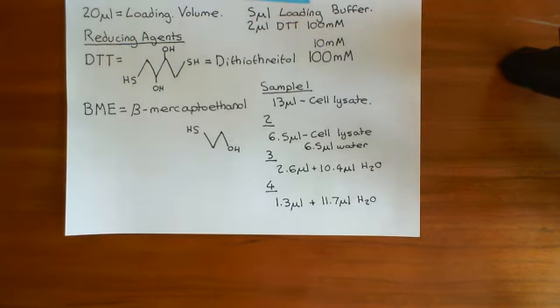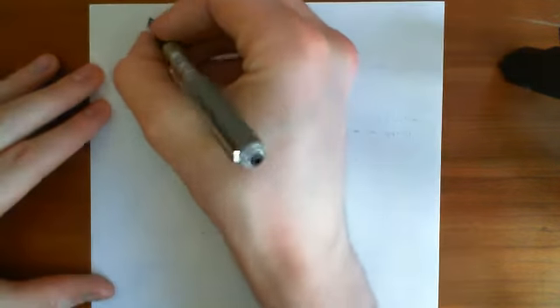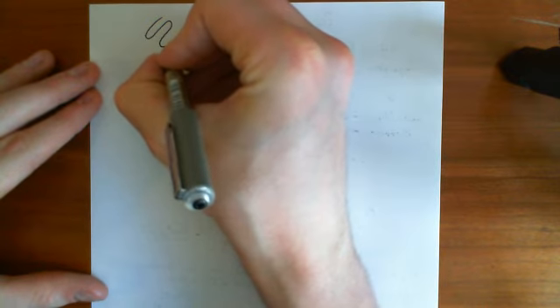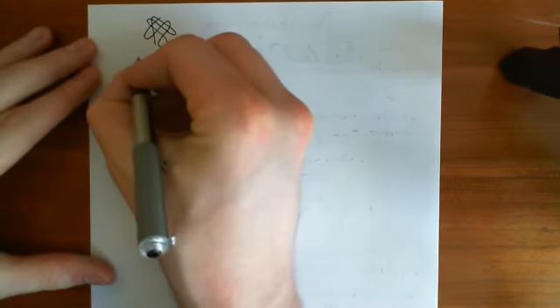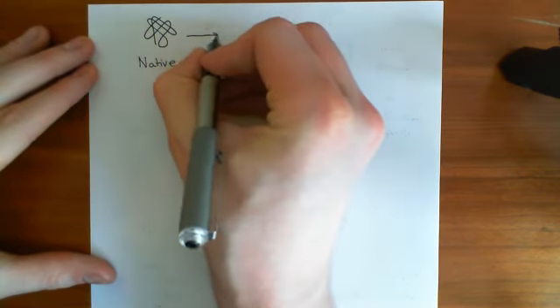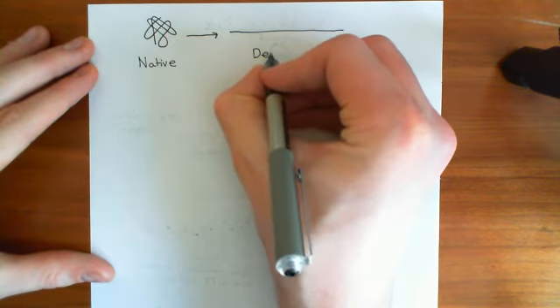We're going to do a denaturing gel electrophoresis. So we want basically to denature the proteins. Now what does that mean? Well, basically, proteins are usually in a complicated structure in three-dimensional space. Remember, proteins are polymers of amino acids, but they aren't just linear structures usually. They usually fold up into some elaborate structure, okay? So this is the 3D structure, or the folded structure of my protein. Basically, this is called the native form of the protein, okay? Now, the denatured form is the totally unfolded form, so when you just have a linear polypeptide, like so.